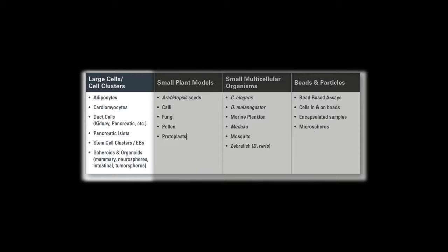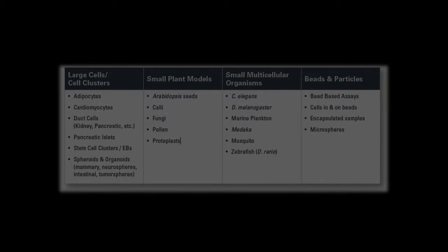Samples such as large cells and cell clusters, small plant models, small multicellular organisms, and large particles can all be processed on a single biosorter instrument.